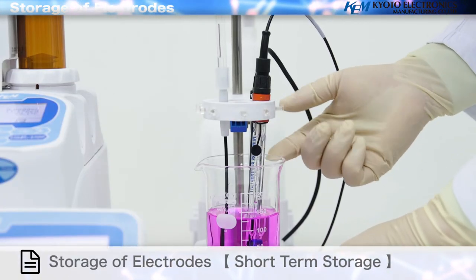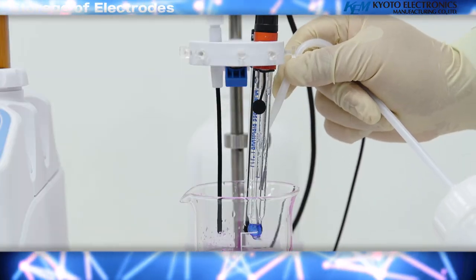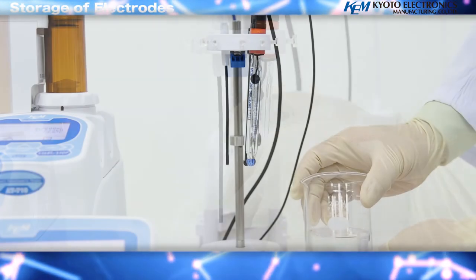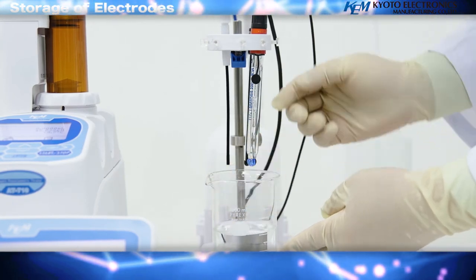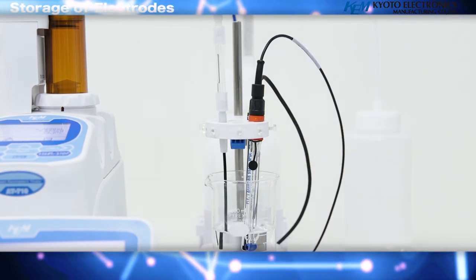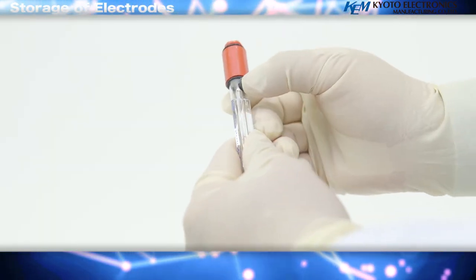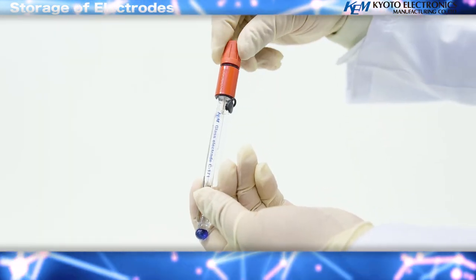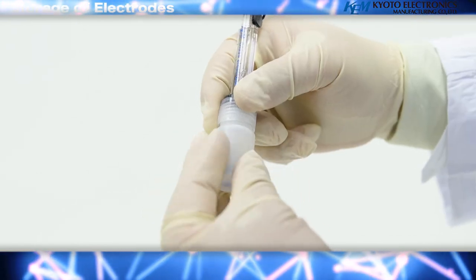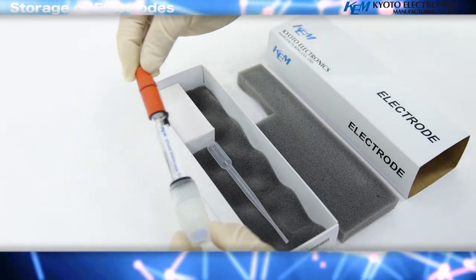Short-term storage: remove the electrode from the measured solution, rinse with pure water, and wipe with clean filter paper to remove any contamination. Storage is completed by placing electrodes in a preservation solution or pure water prepared in advance. For long-term storage, place the electrodes into a preservative solution in the included electrode preservation bottle, tighten the cap firmly, and keep the electrode in a designated case.